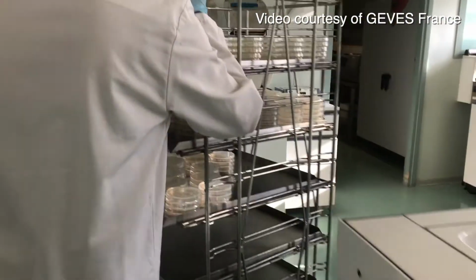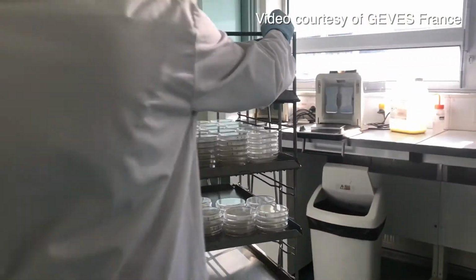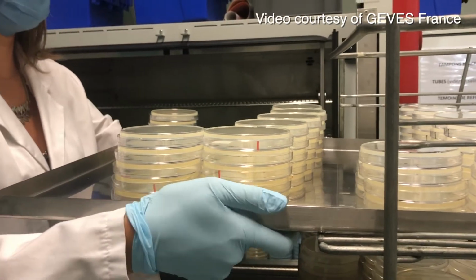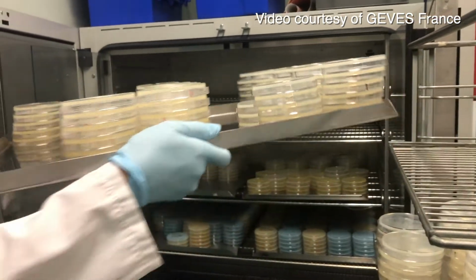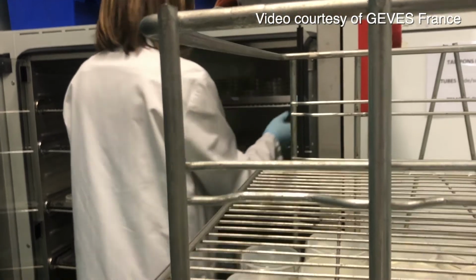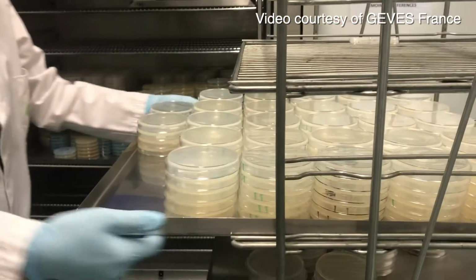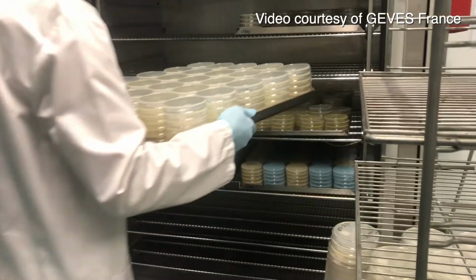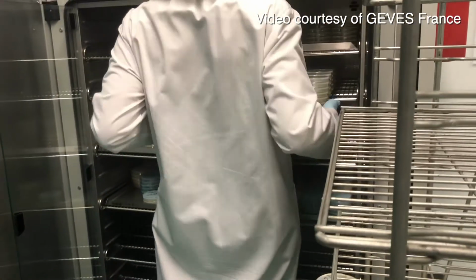So as soon as 2012, so before the method was submitted and published, we already had the view of continuous improvement, and we wanted to start a new project to have an optional test with confirmation of suspect isolates with a PCR assay. So the view was really to save time and to release faster the healthy seed lots, while we were confirming only the PCR positives with a pathogenicity test.